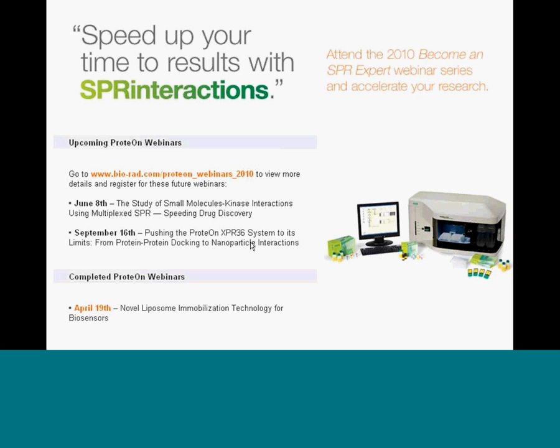It's specific to the interaction between that antibody and its tag. What one chooses to put that tag on is up to them. So I think it's fairly widely applicable in SPR and in other capture strategies. It can be used for just about any conceivable ligand-analyte interaction. Oh, that's great. Does that answer your question? Yeah. So you're really opening up a new corner of the world for folks who are doing SPR.